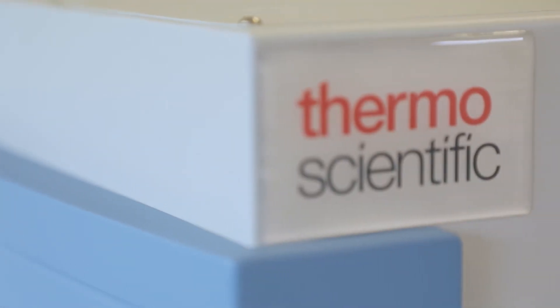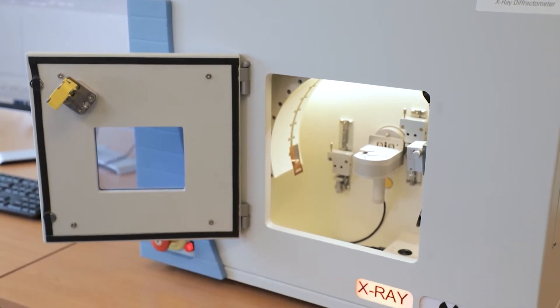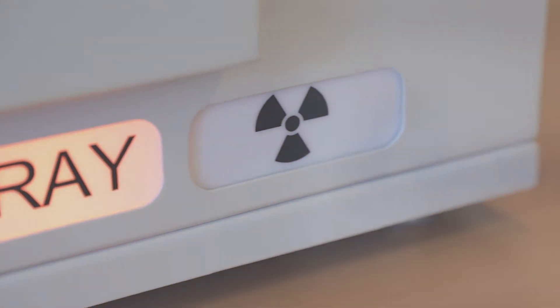The benchtop design is an ideal cost-effective solution for routine quality control in industrial labs, dynamic studies, formulation determinations, and teaching in universities and colleges.